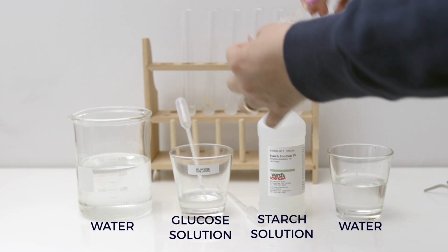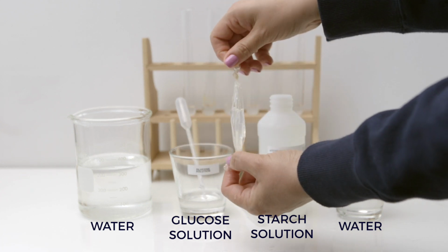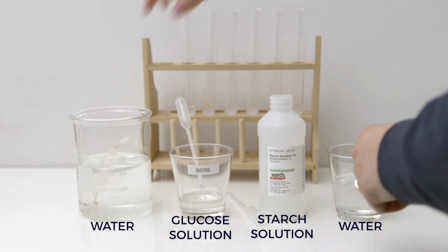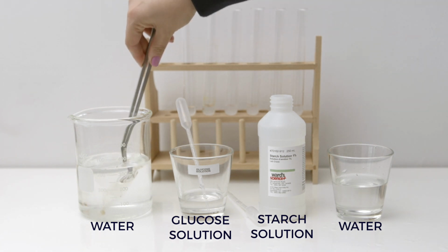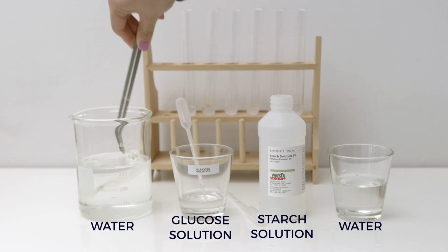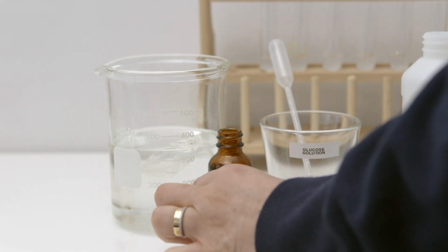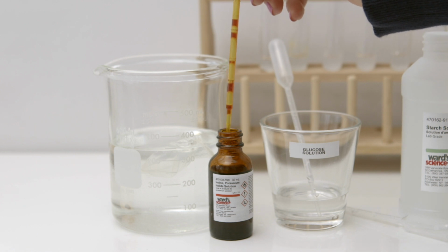The model cell is complete and can be placed into the large beaker of water. Be sure that the model cell is completely submerged. Using a pipette, add the Lugol's iodine to the beaker of water. Observe what happens to the cell.